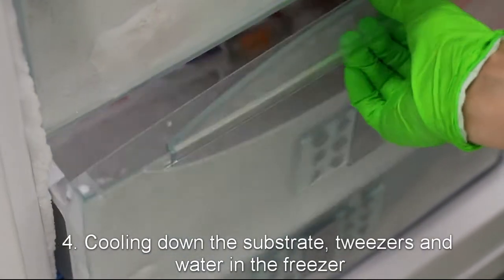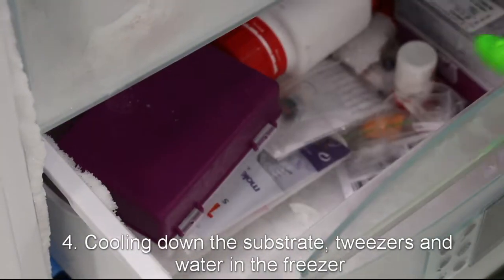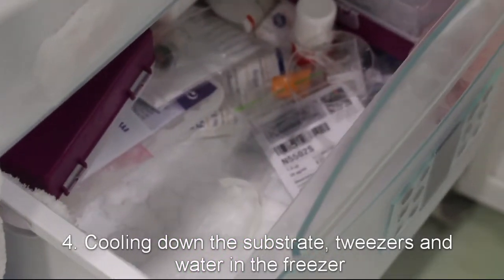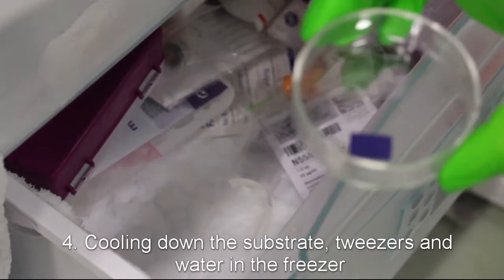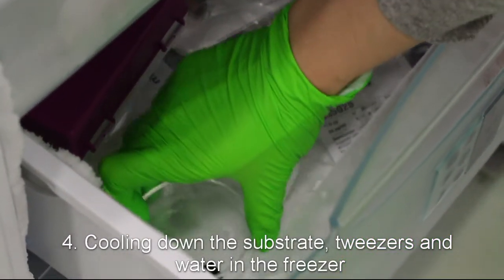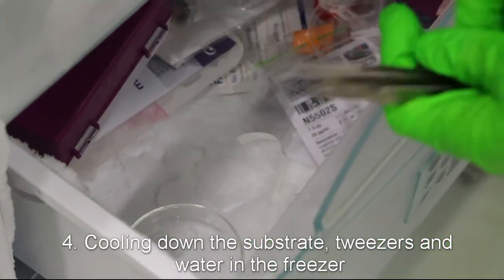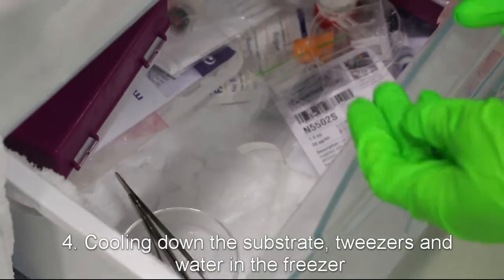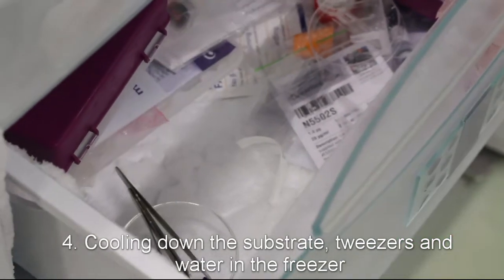Another important detail is that as soon as cyclohexane is solidified, it must be handled in cold to avoid melting. For that reason, while copper is still being etched, we put the tweezers, the target substrate in the petri dish and a beaker of water in the freezer. In such way, we make sure that they are colder than the cyclohexane.